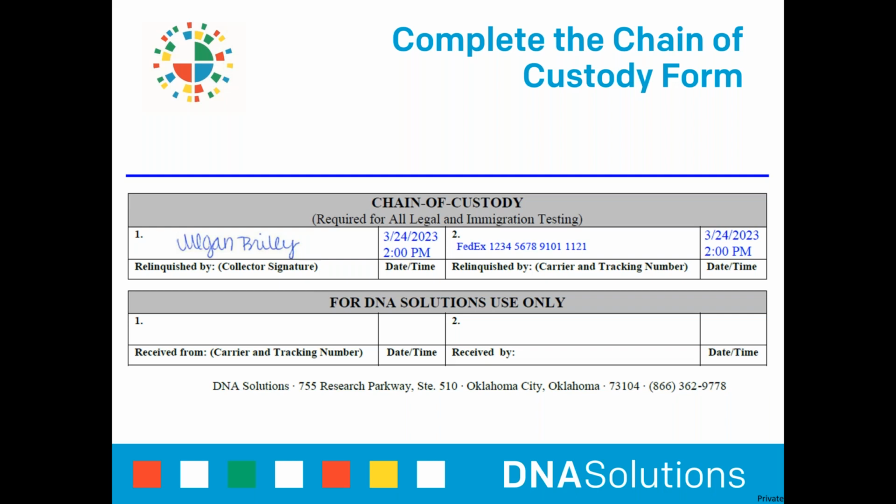If you are using one of our free provided air bills, then you will put FedEx in box 2, along with the tracking number indicated directly on the air bill. Please leave the bottom portion of this section blank as it is for DNA Solutions use only.